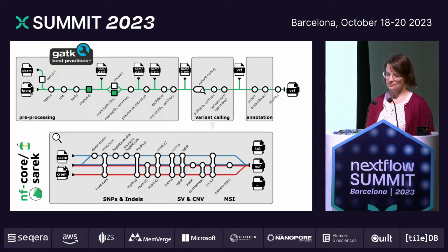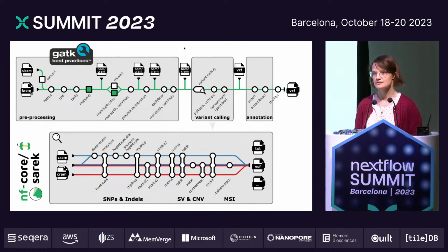As you can see, we have several of these entry points, these file icons here, to facilitate easier reanalysis. Let's say a project runs for a long time, and you were initially supposed to do some sort of SNP calling, and then throughout the project somebody also would like to do structural variant calling. Then you don't have to do this really computationally heavy pre-processing, but can just start from the variant calling, and you don't need to keep the work storage around the whole time.